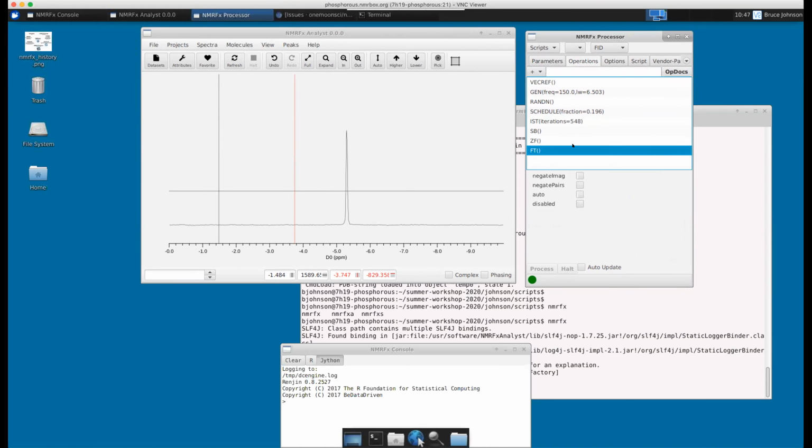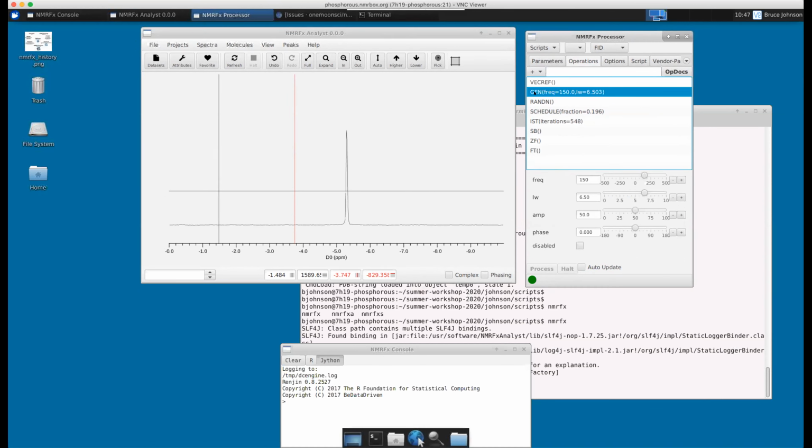Let's add one more thing that's relevant in doing a variety of these things. It wasn't talked about a lot in some of the earlier NUS processing material, but it's actually pretty important. If I go back to Gen FID, we talked about how the data is complex. I simulated an FID that was perfectly phased, but now let's change the phase of that.